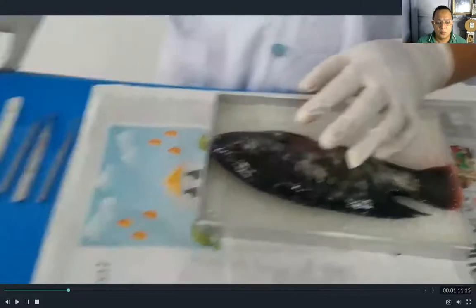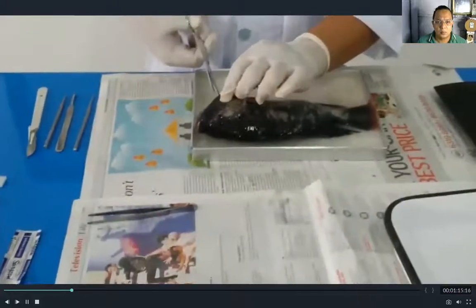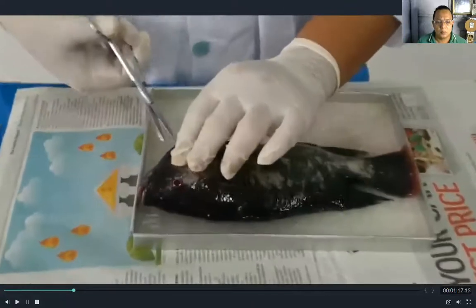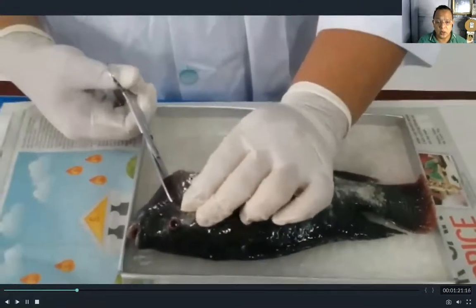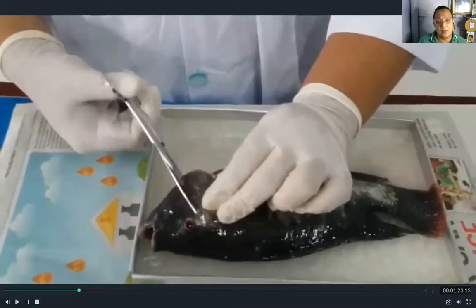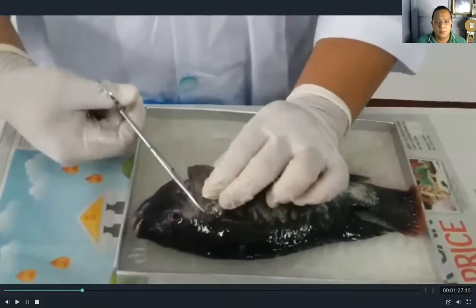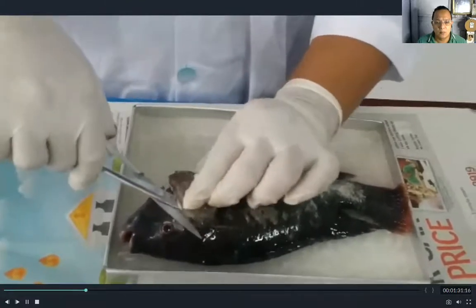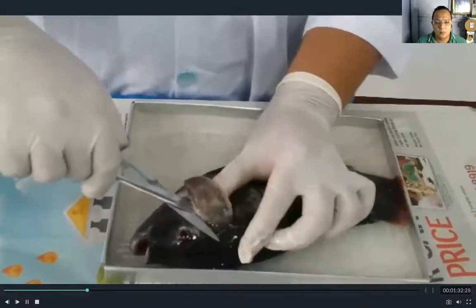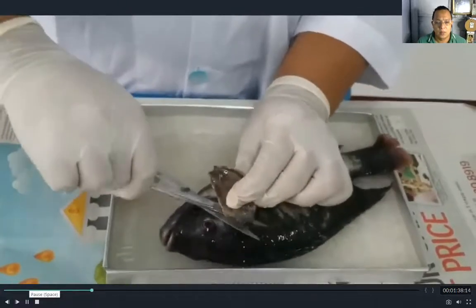Let us cut first the upper flap so that we can see the gills. Take note: you need to be very careful with your materials. Students, make sure you do this activity under the supervision of your teacher.